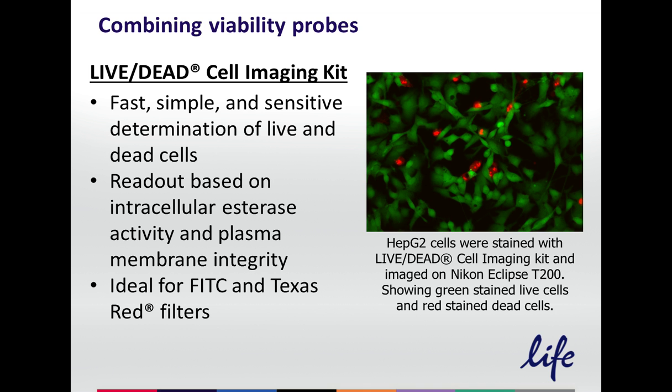So now I just want to acknowledge some of the pitfalls, especially in the imaging of these probes, and actually talk about a new product that was released a couple of months back. Whilst you can use calcein AM and dyes like ethidium homodimer 1 or propidium iodide, their spectra tend to be not particularly amenable to imaging. They have very broad emission peaks and not always optimal excitation properties either for all microscopes.